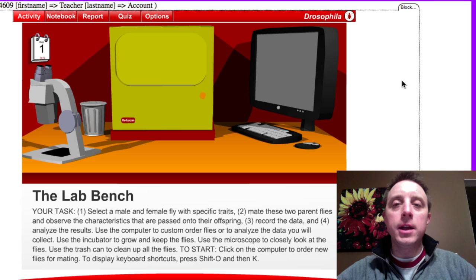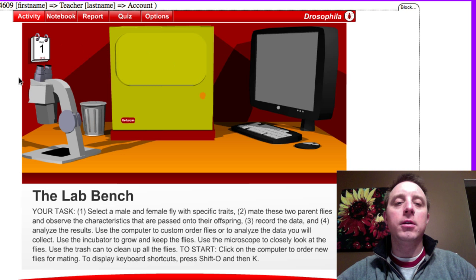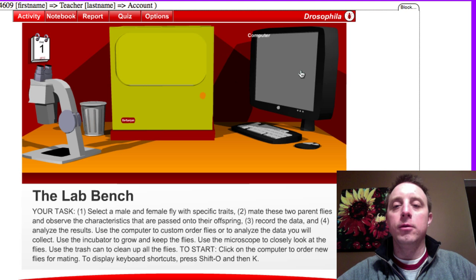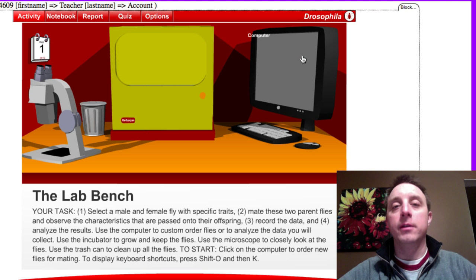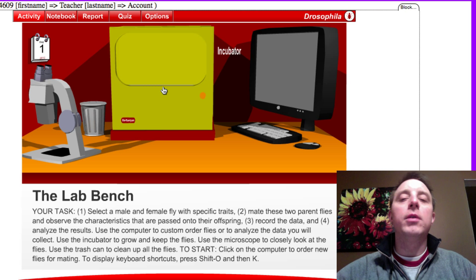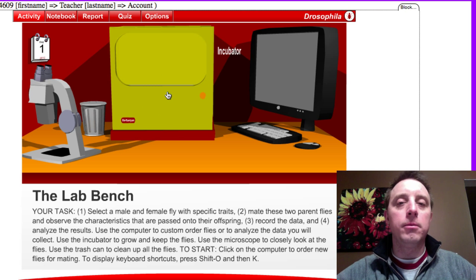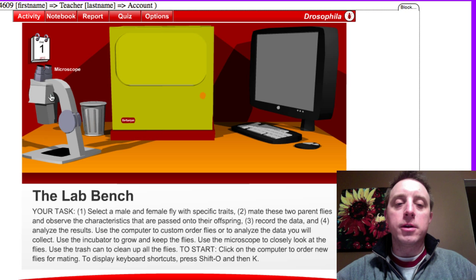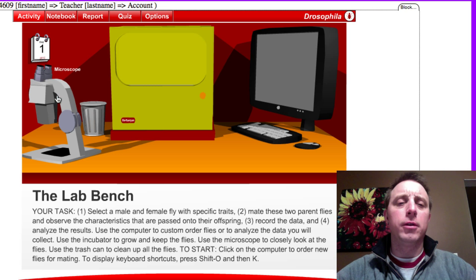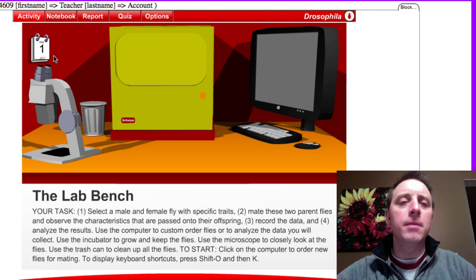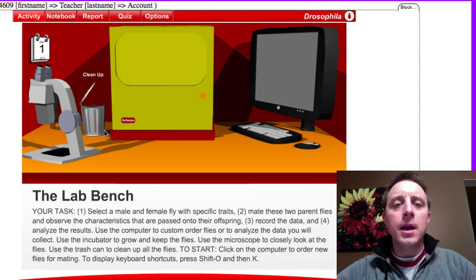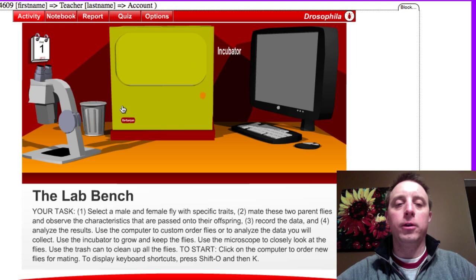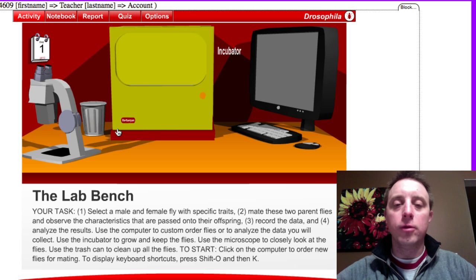Once you get in, the main screen here is our little lab setup with a computer to do all kinds of stuff like analyze the results and order new fruit flies, an incubator where we will keep the flies while they are hatching and mating and growing, a microscope to look at the flies because they're pretty small, a calendar to help us keep track of the days, and a trash can which is very useful when the incubator starts to get full.